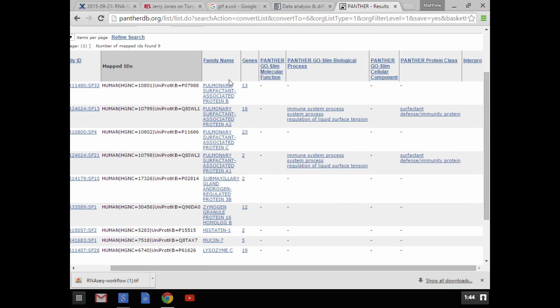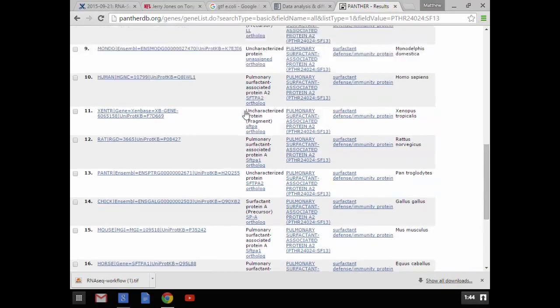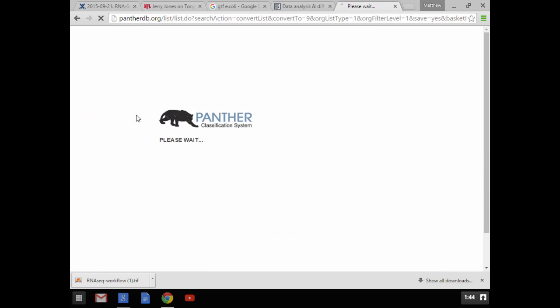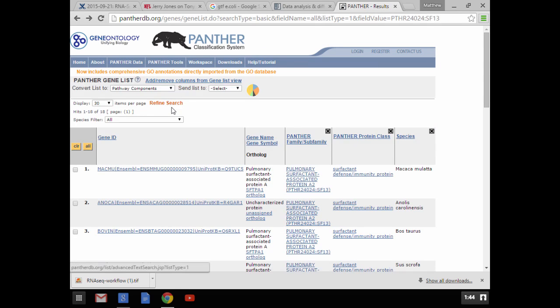Here we can look at what genes are in that same pathway, all of the genes that are involved in that pathway. And this is where you could, if you wanted to, start to build an idea of what story you're looking for. But at a bare minimum, that would give you the ability to let's go all the way back, sorry.